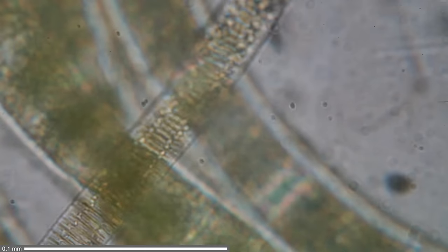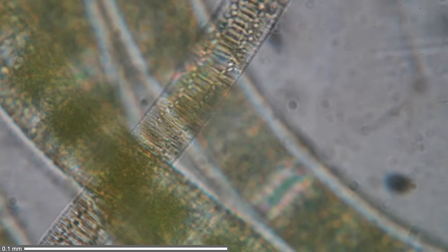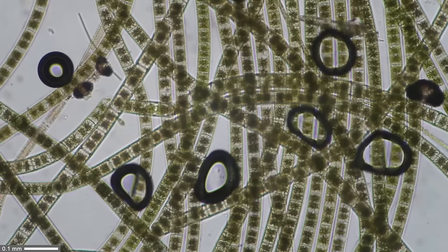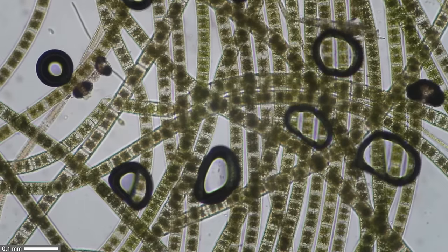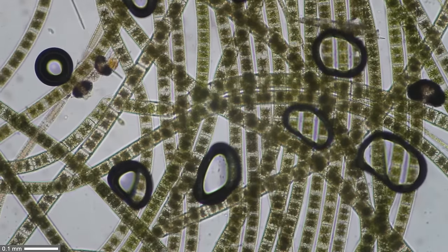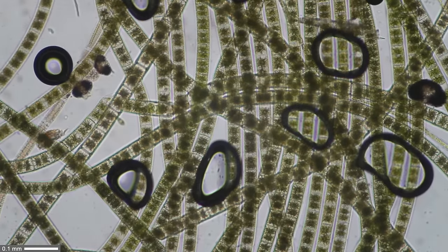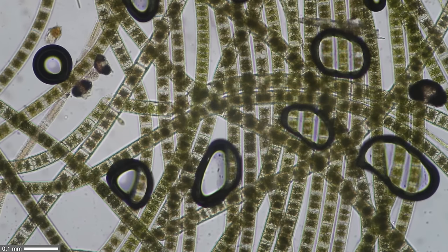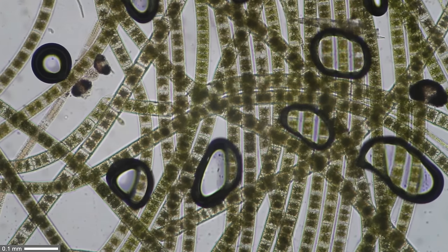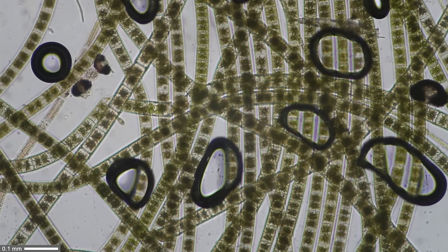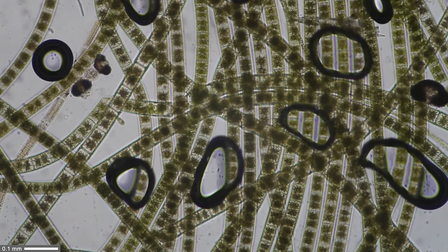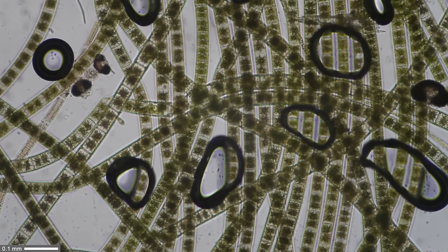Last but not least, I did another time lapse. I like doing time lapses. These are now oxygen bubbles that you see growing. The oxygen is produced by photosynthesis by the algae. You can see how they're increasing in size. This was actually quite a long sequence and I was speeding it up quite a bit.